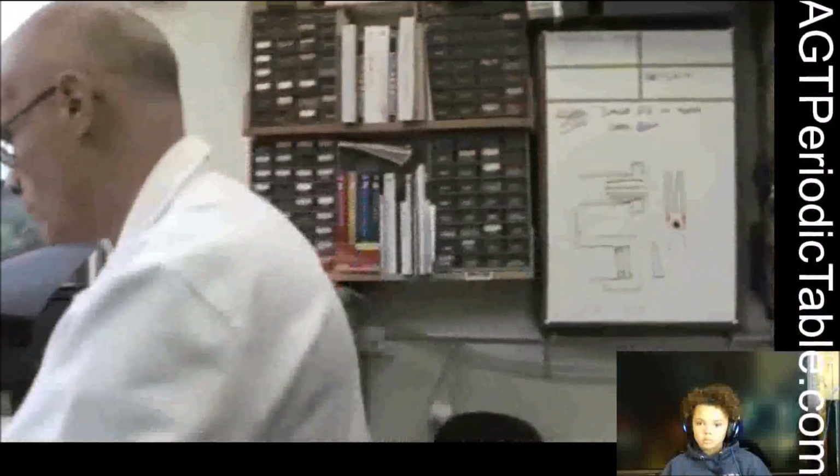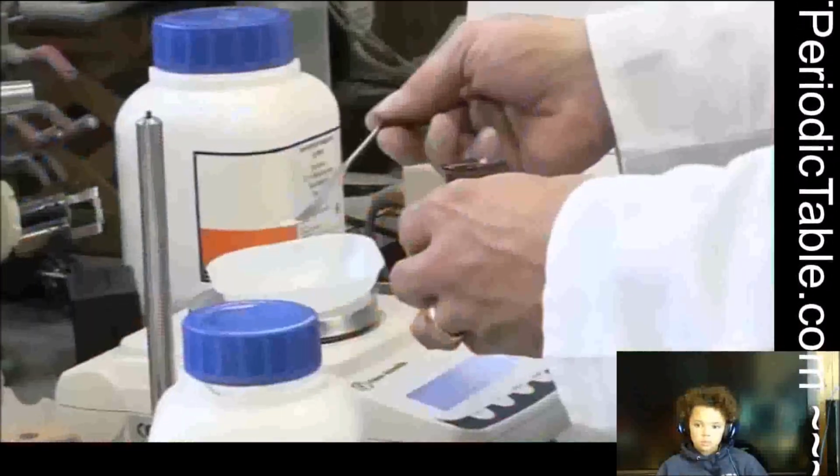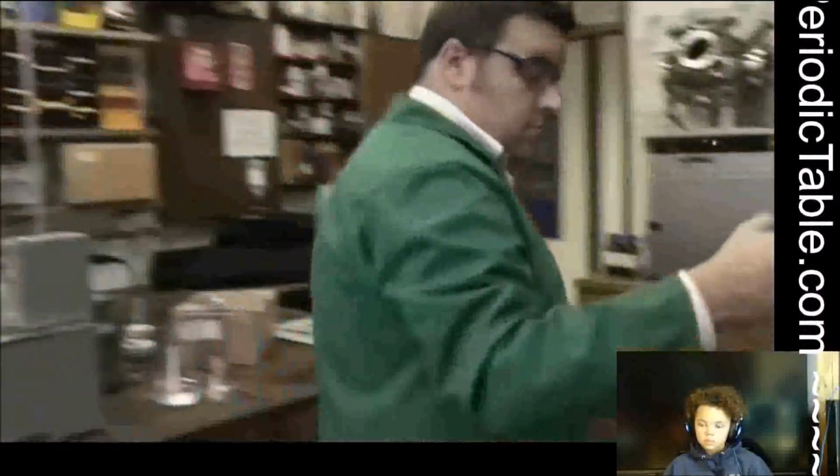Okay, so we take these two components and we mix the two together very intimately, and Neil's just weighing the materials out right now. So we're going to put the magnesium and the silver nitrate, the two powders, together into a small plastic container here. We're going to mix them very, very carefully, and then we're going to see what happens when we sort of initiate a chemical reaction.